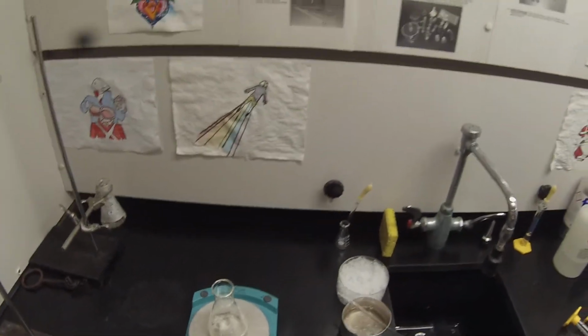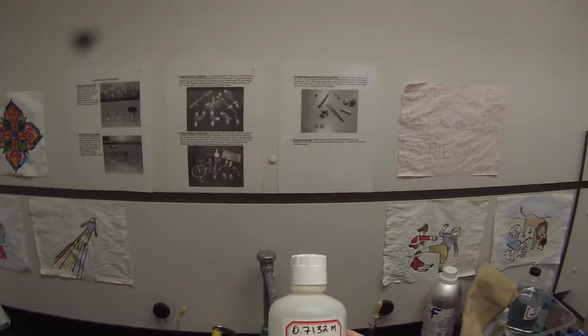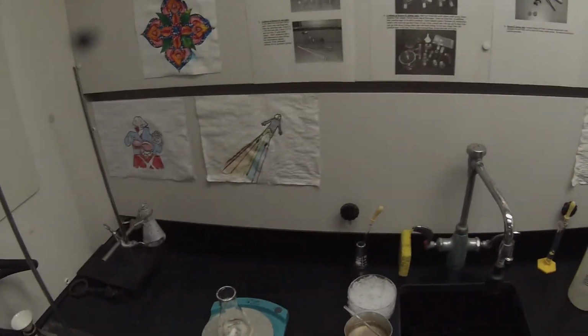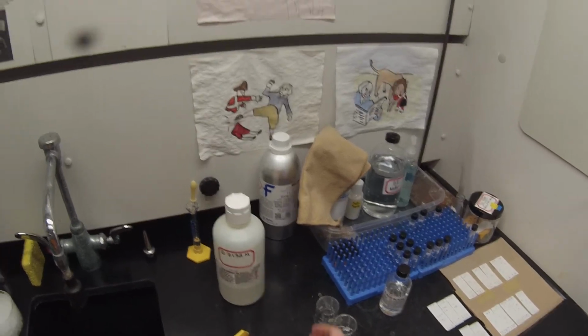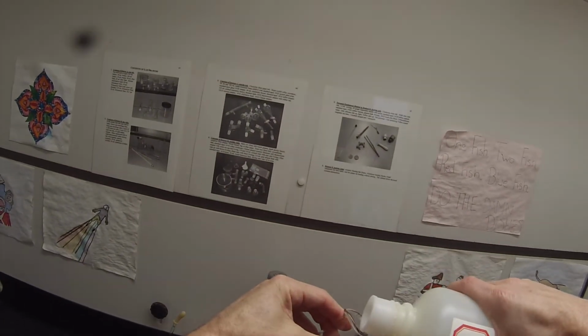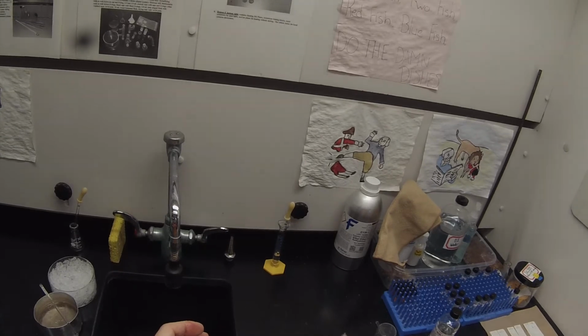Probably won't all dissolve until we add the sodium hypochlorite solution. And this sodium hypochlorite solution is 0.7132 molar. That was titrated last year, though. It's probably not exactly 0.7132 molar. I am adding 10.78 milliliters according to the pre-lab calculation of that 0.7132, but I'll probably add more like 12 because I suspect that it's not quite the concentration that it says it is. So I'm going to go ahead and measure that out too, so it's ready when I need it. And it's about 12 milliliters.